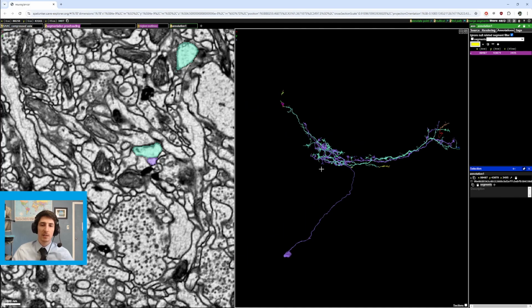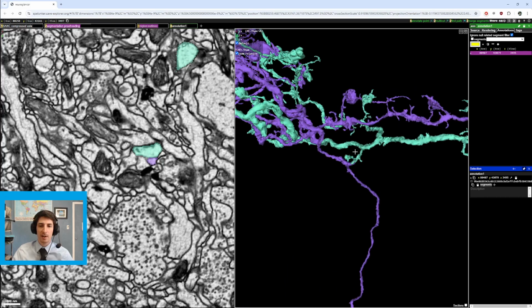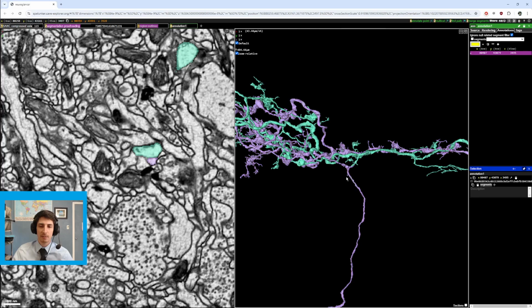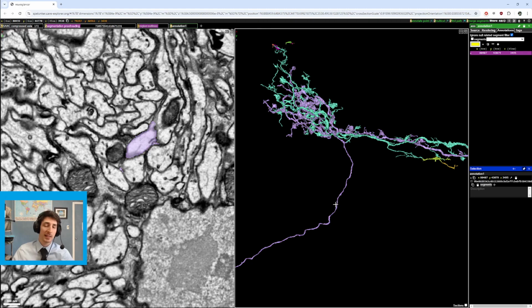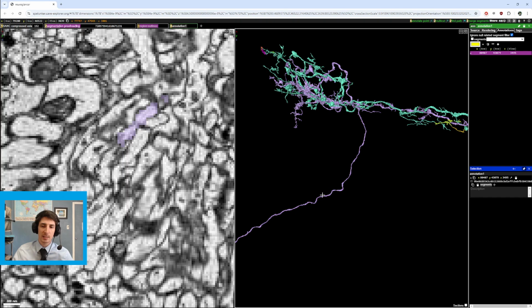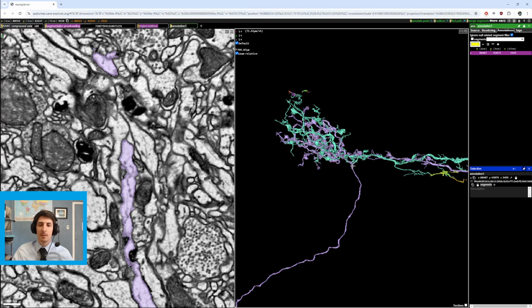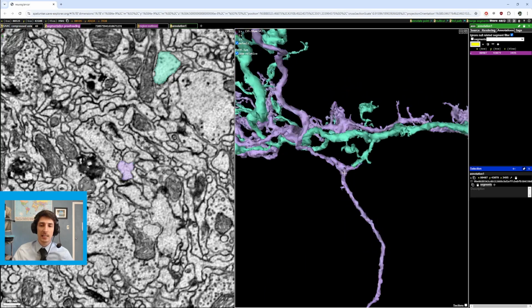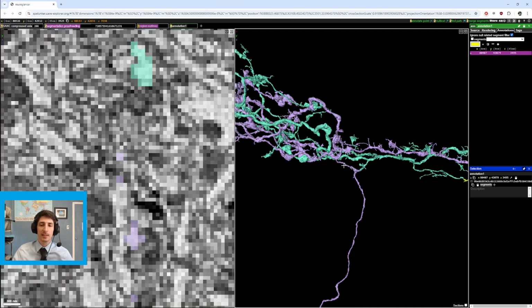And this is starting to look kind of like that cell we brought up earlier, right? So now off of this, it's coming out of the middle. We have a nice thin, medium-sized soma branch. Now, you might not get so lucky. Maybe half of this is cut off and you're going to have to trace piece by piece this way through a couple of mergers, which can be difficult. But if you don't have any indication of where the soma is, this would obviously be really great to find.